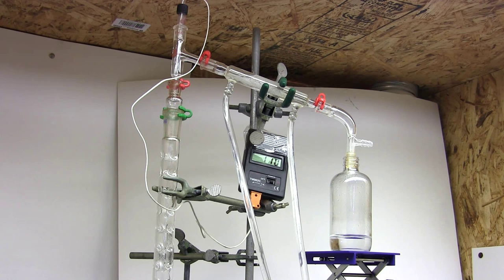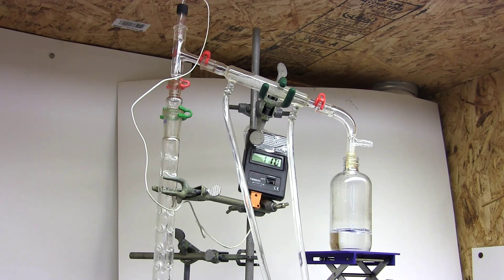Two, we can buy an even longer column to get more separation power and thus possibly separate the components. But as you can see I don't think I can fit a longer column in my existing setup. And the third way is to improve my existing setup by insulating the column.